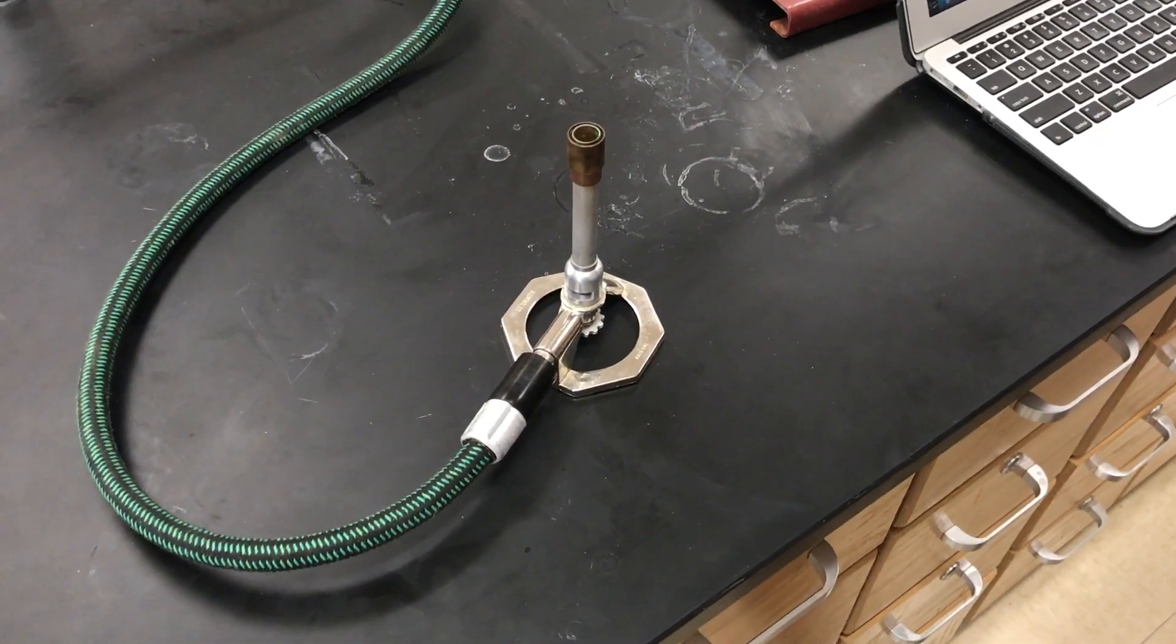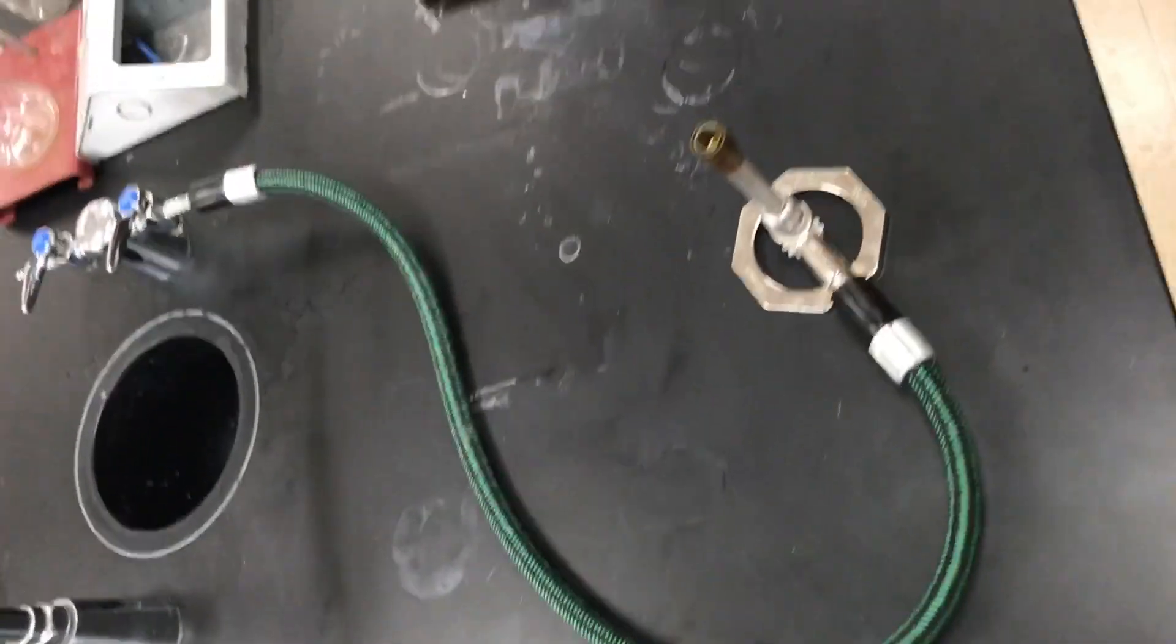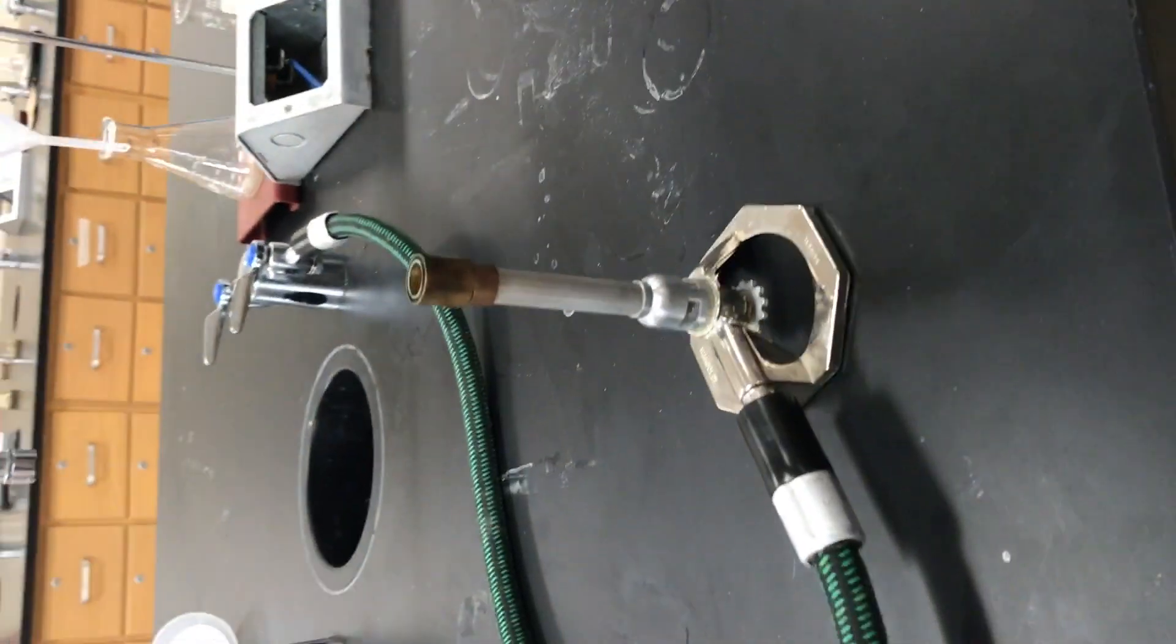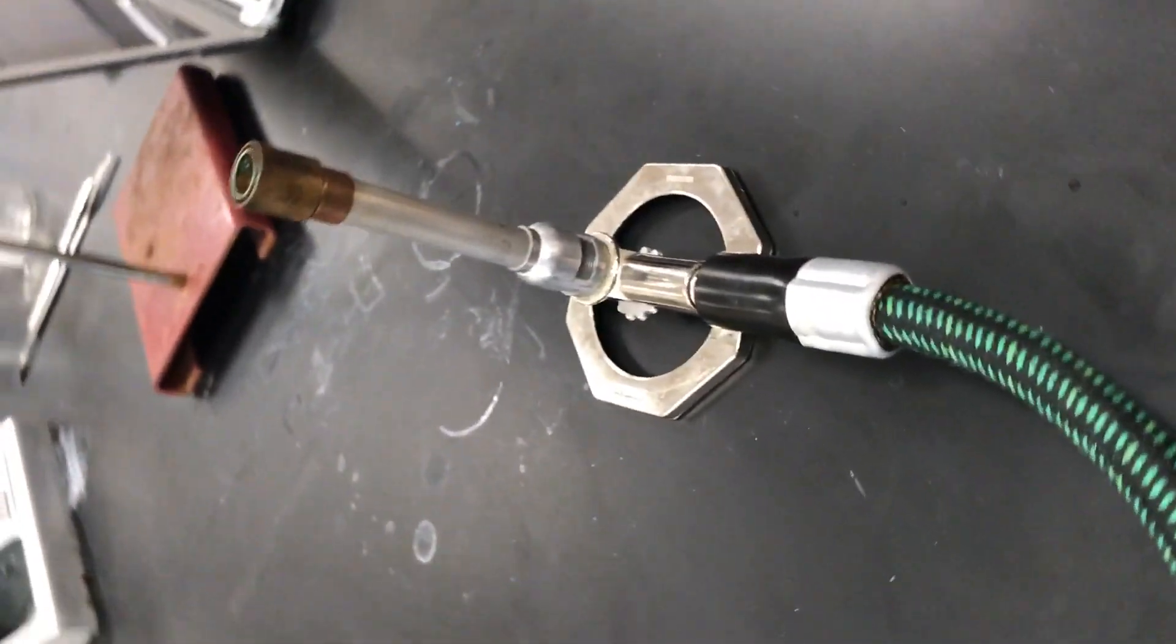This is a Bunsen burner. It produces a single open gas flame which is used for heating, sterilization and combustion. It's named after Robert Bunsen because of his innovation of burning stands for the University of Heidelberg.